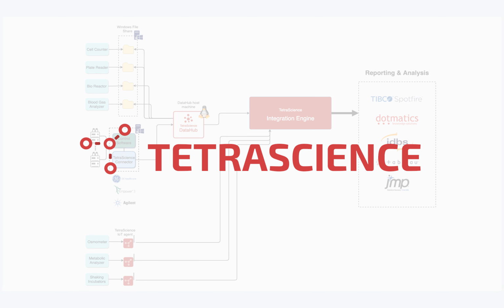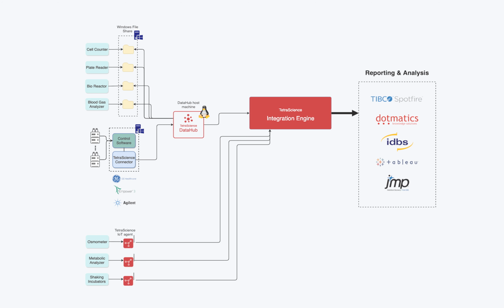TetraScience connects to many instruments that are used in a typical bioprocess development workflow. This drastically reduces manual data transcription, resulting in a streamlined process. Let's first look at a simple diagram to see how TetraScience collects data from various instruments.